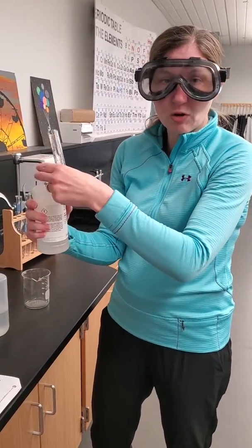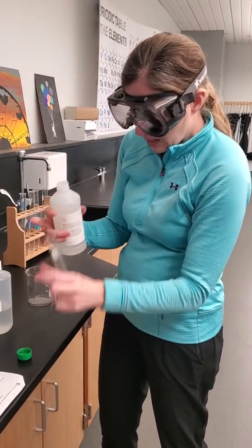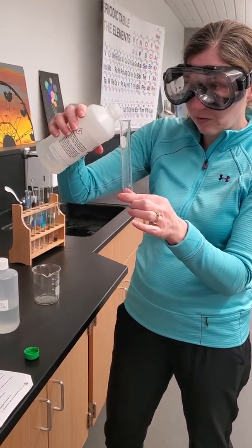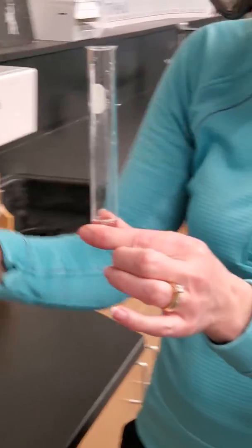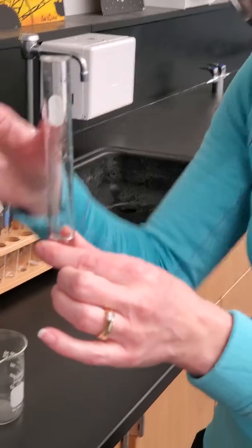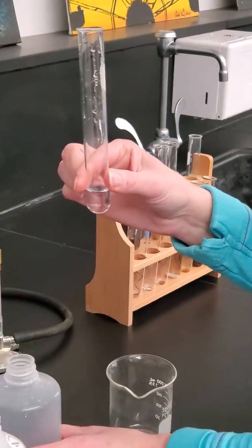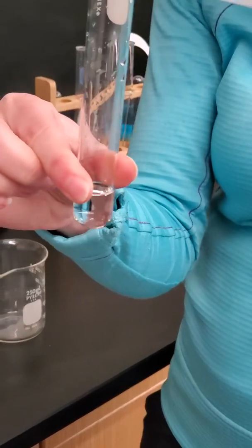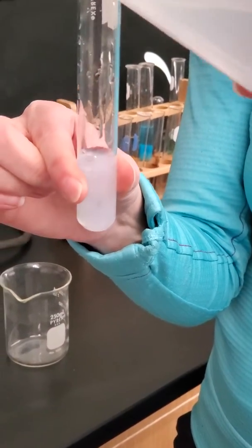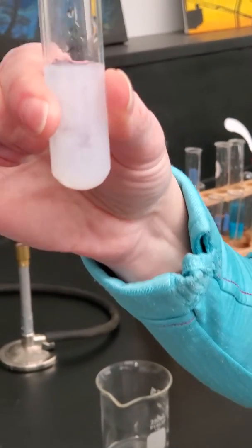And instead of measuring out exactly 5 milliliters, I'm going to just use my fingers as a guide. So the first one I'm going to fill up to my first finger level. And the second one I'm going to fill up to my second finger level. Try to get a good angle for you. And instantly you see white solid precipitate formed.